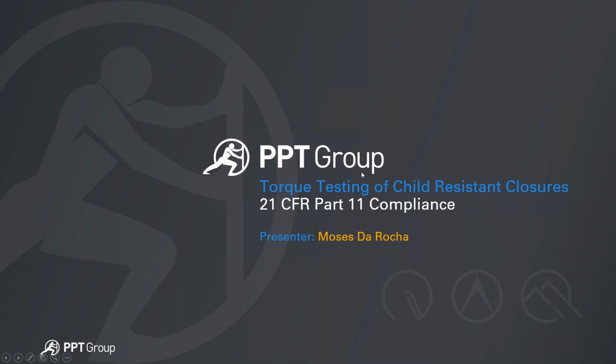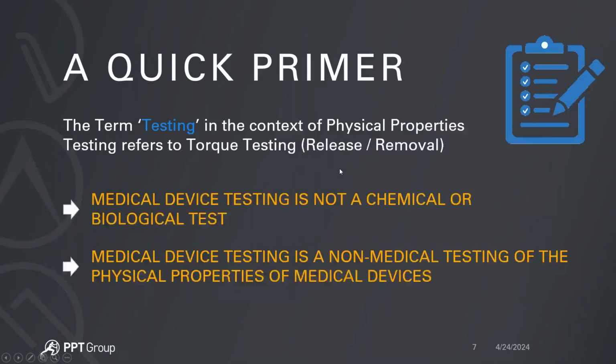So, all right, without further ado, quick primer. I know every time we talk about the medical device and pharmaceutical industries, when you throw the term testing around, it kind of confuses people a little bit. So I'd like to clarify at the very onset that the term testing in the context of physical properties testing refers in this case to torque testing. In other cases, it might be compressive testing, tensile testing, and so on. In this case, it's going to be the release or removal torque of actual child-resistant closure caps.